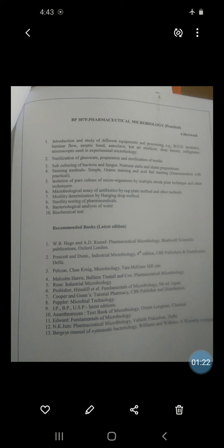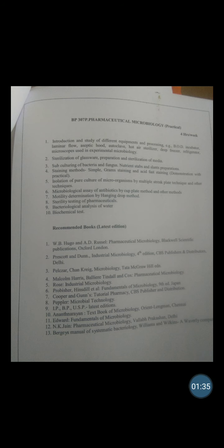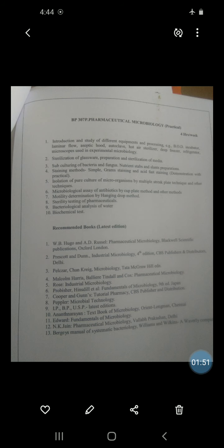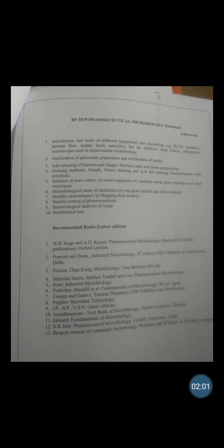What are the requirements for this practical? A glass slide with a depression in the middle, an inoculating loop, a microscope, a burner, paraffin wax, a cover slip, fresh culture of motile bacteria, vaseline, and a toothpick. These are the requirements for this practical.